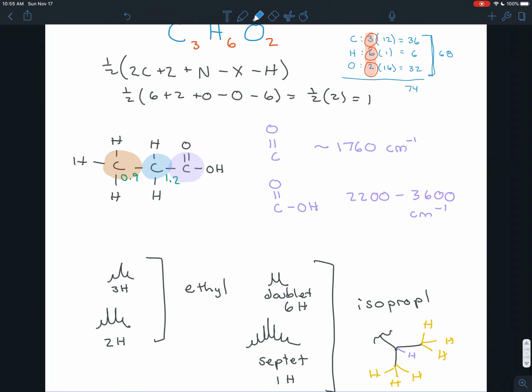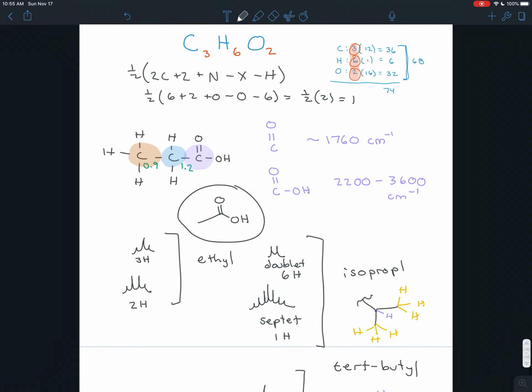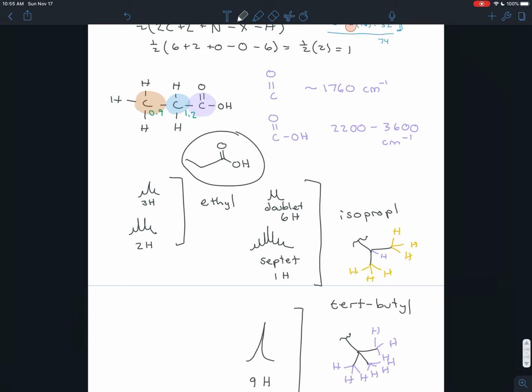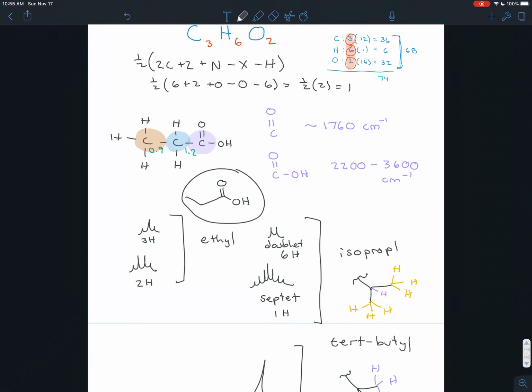And there it is, propanoic acid. We have a clear liquid, looks like water, but by throwing it into a few machines and knowing how to read the hieroglyphics that they spit out, we're able to connect that, that's propanoic acid. We're able to connect that macroscopic experience of a molecule with this conceptual drawing of one that we've been working with, and now we can connect it with all the different recipes that we learned.